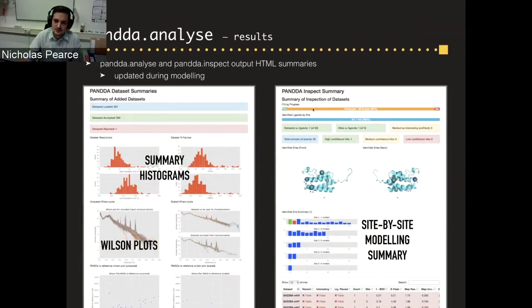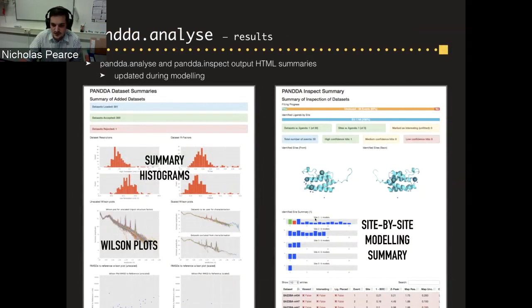PANDA Analyze doesn't just give you a log file — it produces pretty HTML summaries including histograms of the distribution of RFrees and high-resolution limits over your crystals, overlaid Wilson plots for all data sets (enabling identification of nasty ice rings integrated into some data sets), and a summary of every ligand you've fitted once you start modeling in PANDA Inspect.